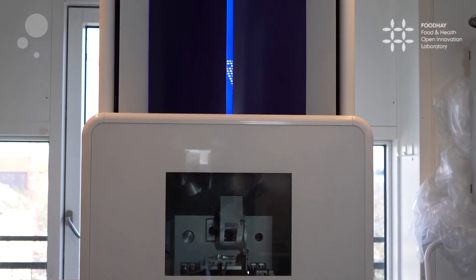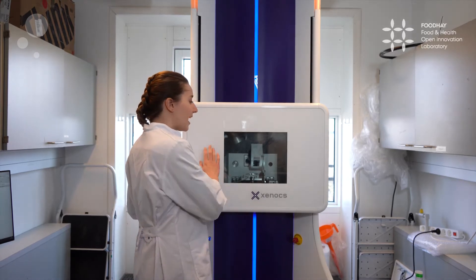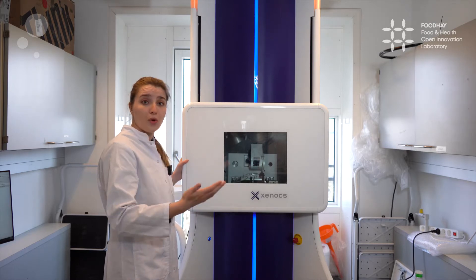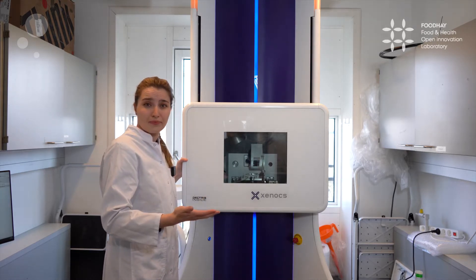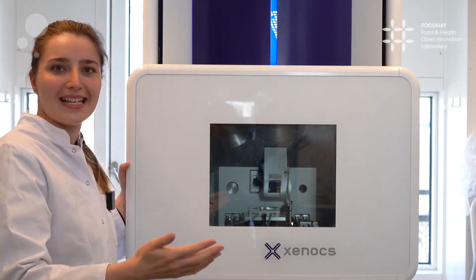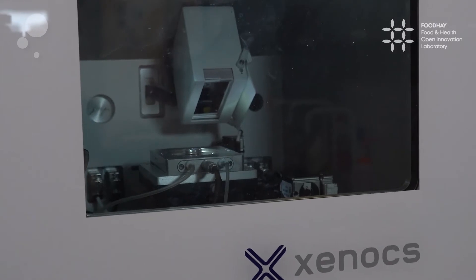Over here I would like to show you how I introduce a sample to the equipment. Now there is air inside the sample chamber. It is important to note that we usually work in vacuum, because that way we can minimize the interactions from the environment. So we always evacuate the chamber before starting a measurement.